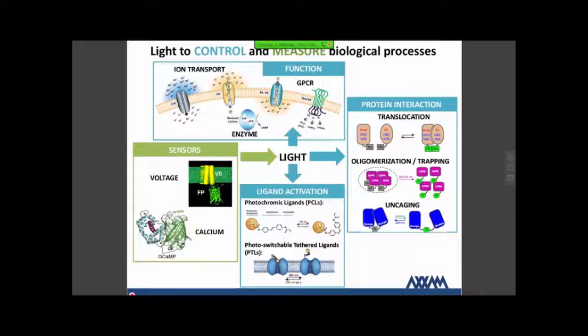All these tools are very important because due to the fact that they can be, for example, activated by light, you could achieve a degree of precision of stimulation that you couldn't achieve with any drugs or chemicals. And because you can deliver the light stimulation in a very fast way, you can do it in a reversible way. And this is something really very powerful. And the optical tool that I will show you today belongs to the Channelrhodopsin family, so an ion channel protein activated by light.